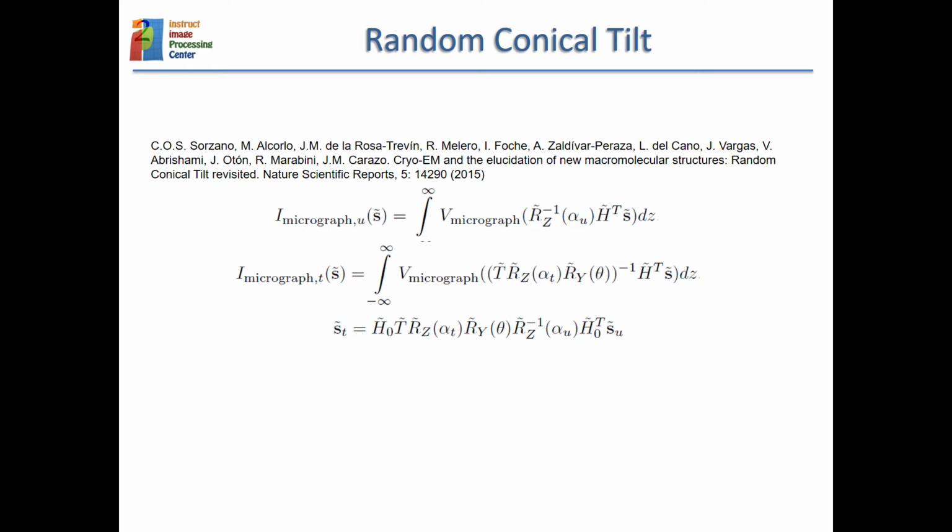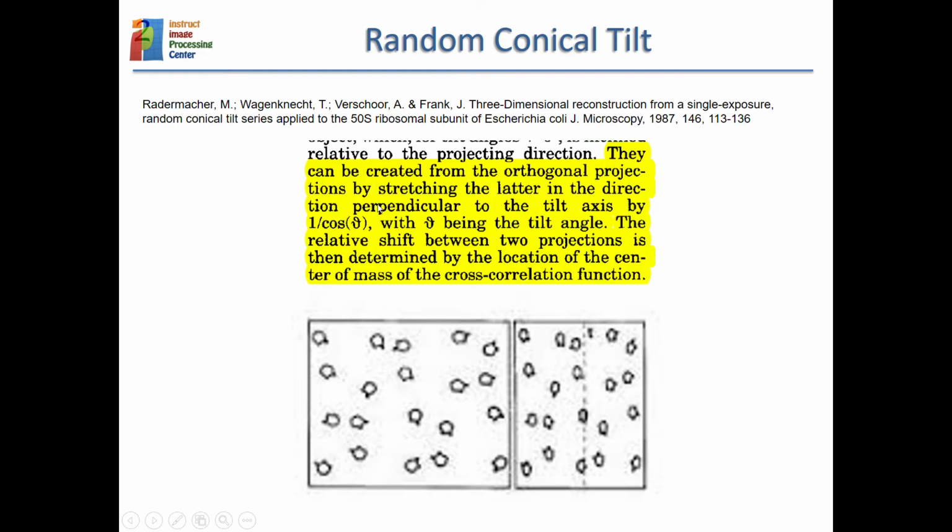In the original formulation, the mathematics behind the correspondences can be rather complicated. You have the whole description in that paper. But there is a very simple intuition: when you tilt, there is a compression of the information along one of the axes. In the original derivation, this axis was supposed to be vertical.